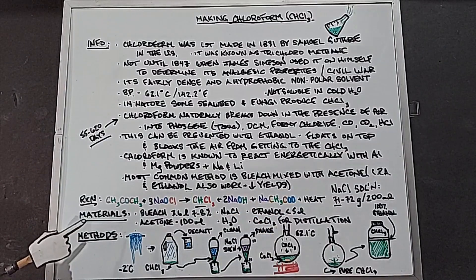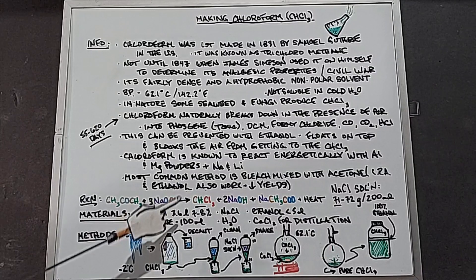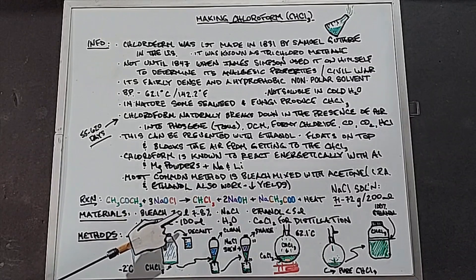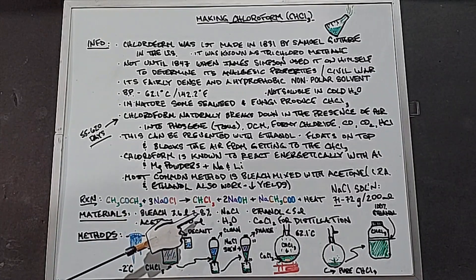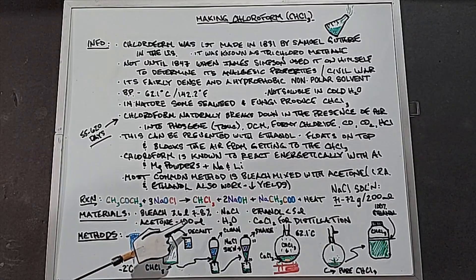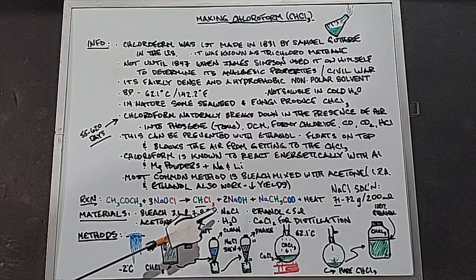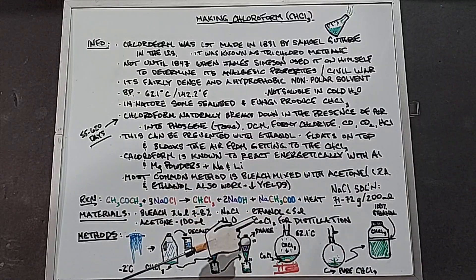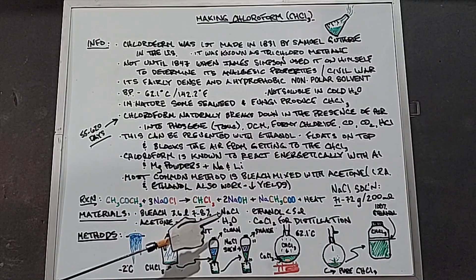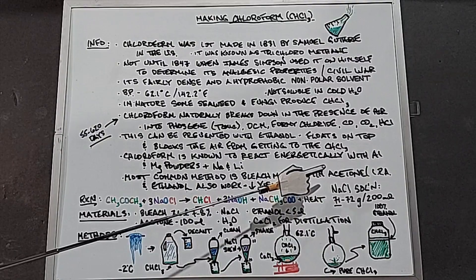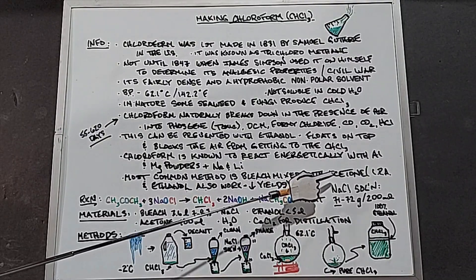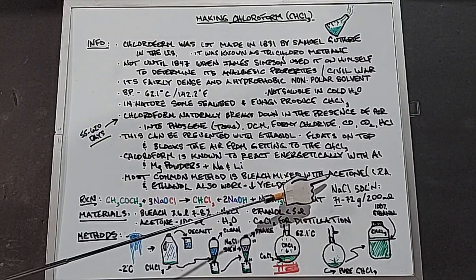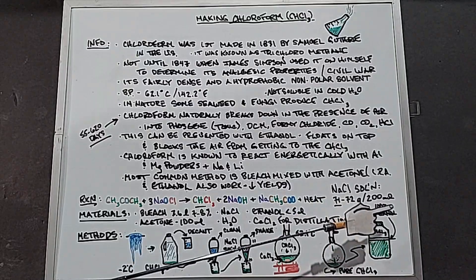The materials we need are bleach, about 3.6 liters, which is an average container in the United States at around 7% acetone, 100 milliliters. We need sodium chloride, water, ethanol as we discussed, and calcium chloride for our distillation. The salt and water are going to be used to make a salt solution, and I'm going to do that by mixing 71 grams of sodium chloride, iodine-free, with 200 milliliters of water.